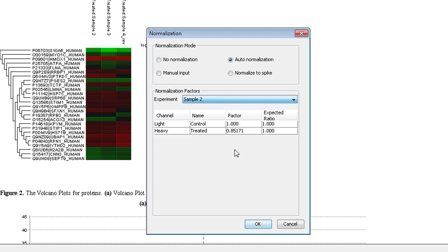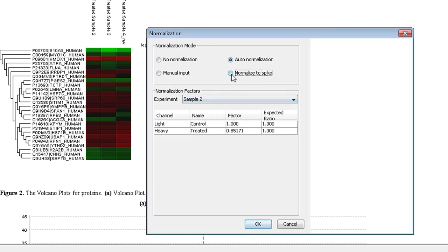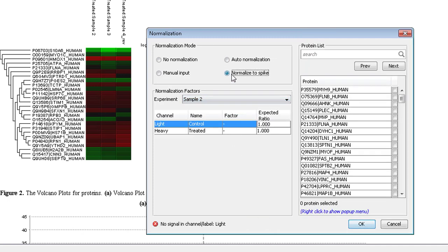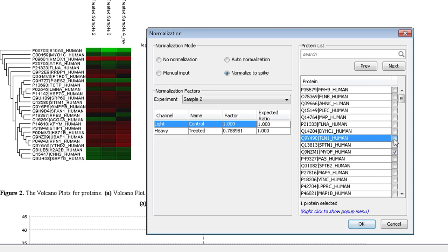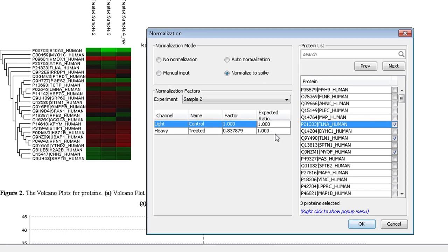Other options are available, such as normalize to spike, referring to a spiked-in protein. A list of all quantifiable proteins will be displayed. Select a protein or group of proteins that you know of a certain ratio, and enter the expected ratio in the expected ratio field. Then apply the changes.